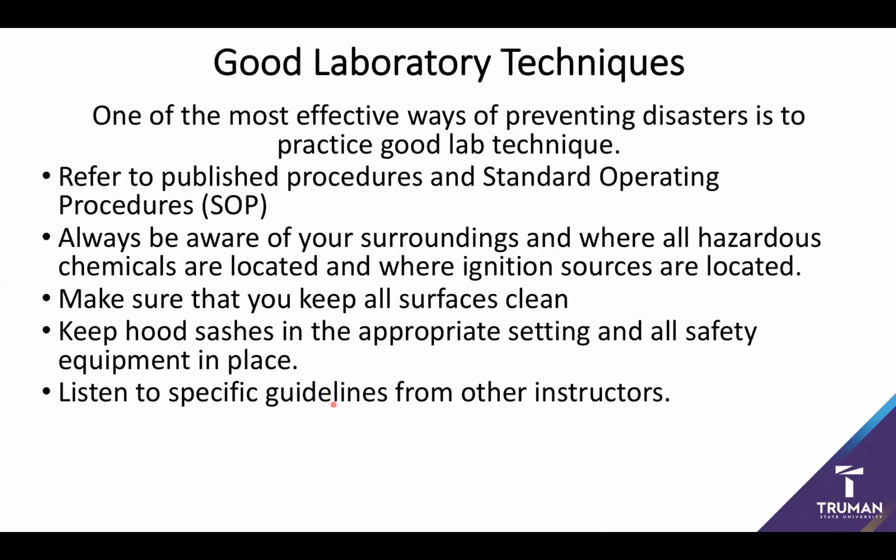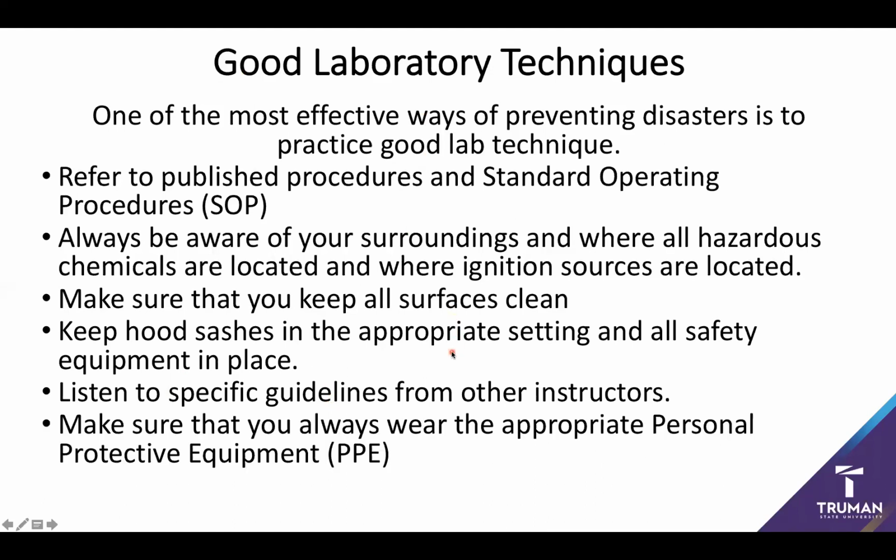As one of our major goals is teaching good lab technique, and part of that is good, safe lab technique. Again, one of the big things that is always worth noting is while it might be the last step of protection, always make sure that you wear the appropriate PPE. If you don't, then you can start getting in danger when something does go wrong.